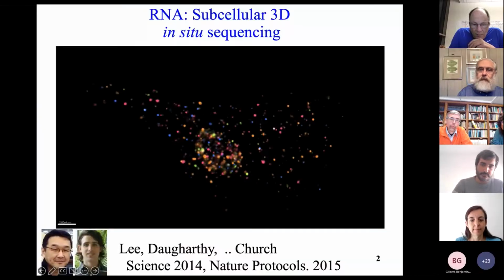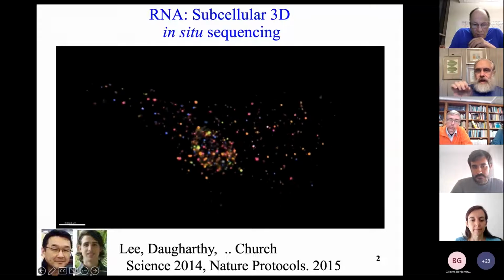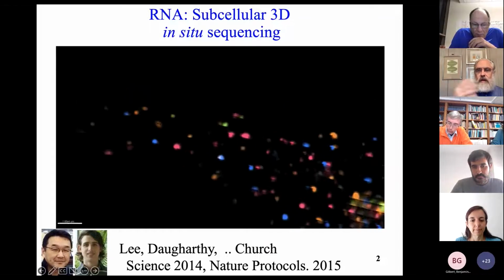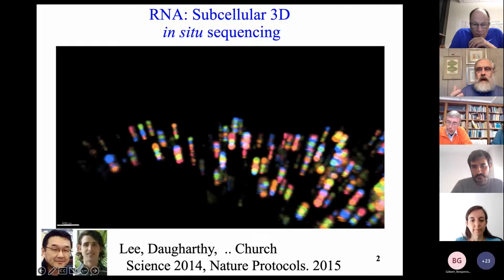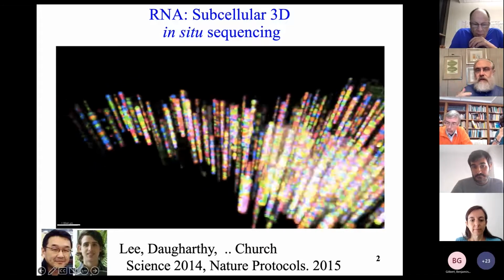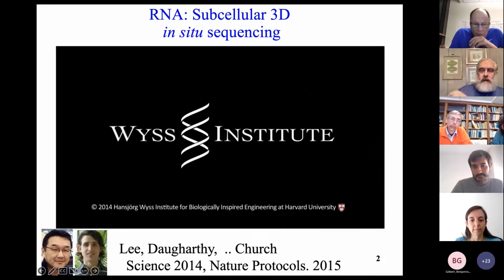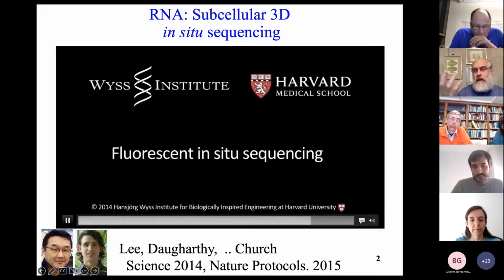And this is, again, from the Wu lab. And this is RNA, single cell, each dot staying in place, changing color, GATC, the 4 colors, 4 bases, and then you can have the computer recall all of those rounds of fluorescent next-gen sequencing essentially in situ, and now each of those vertical lines was a barcode, an RNA barcode.